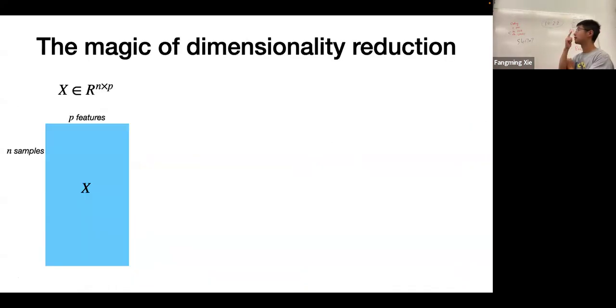So next session, we're going to talk about dimensionality reduction, because each gene is different and there are so many different genes. What's the essence of the structure of that data? Dimensionality reduction says that if you have a big table like we do, of n samples, where n is the number of cells in our case, and p features, where p is the number of genes.